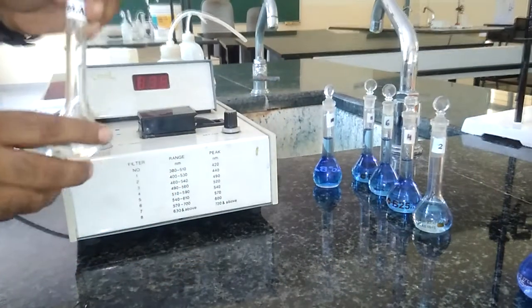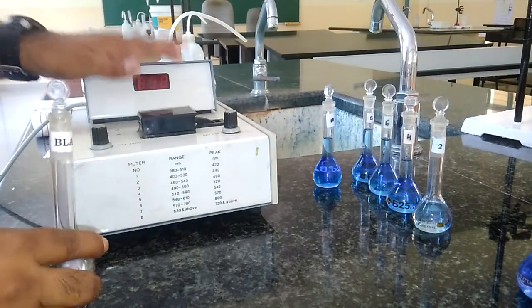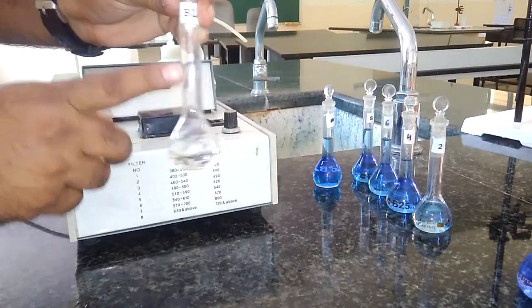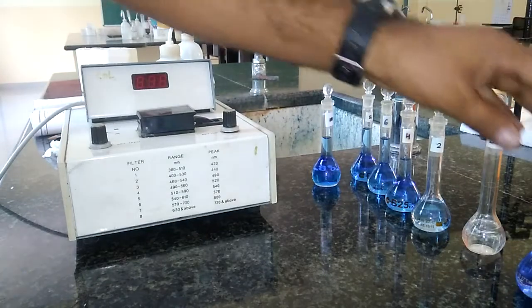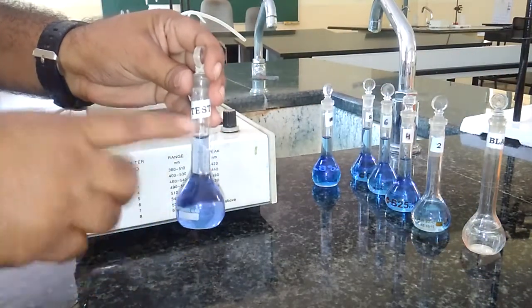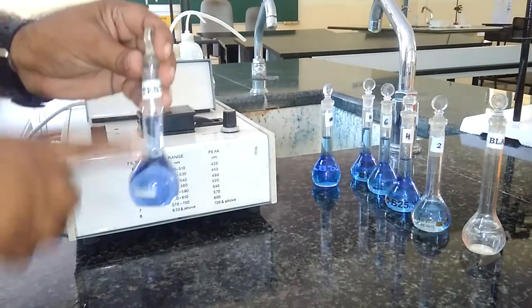The blank solution is used to set the optical density or absorbance to 0. It is prepared by adding only 2.5 ml of ammonia and the rest is distilled water. Similarly, for the test solution obtained from the examiner, we add 2.5 ml of ammonia and the rest is water.